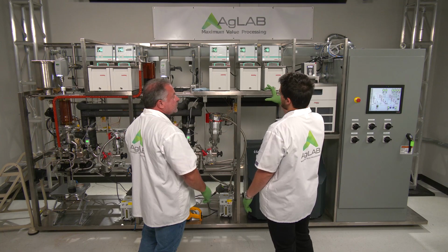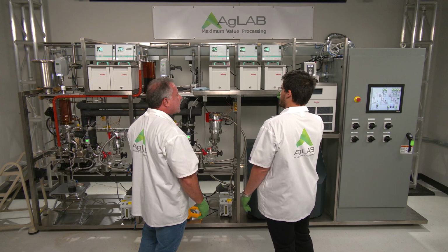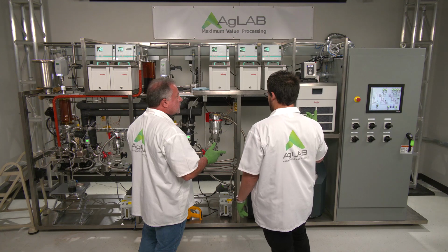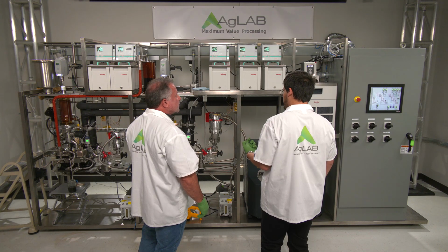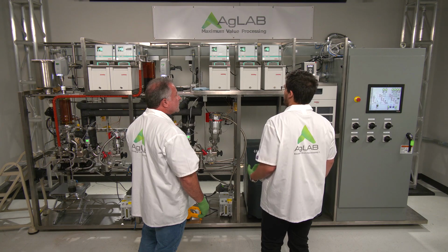The way to selectively choose which molecule you want to collect is, okay, you've freed all of your molecules, now you have to select a condensation temperature, the condenser, that will collect what you want. All things that are very heavy will condense onto it.